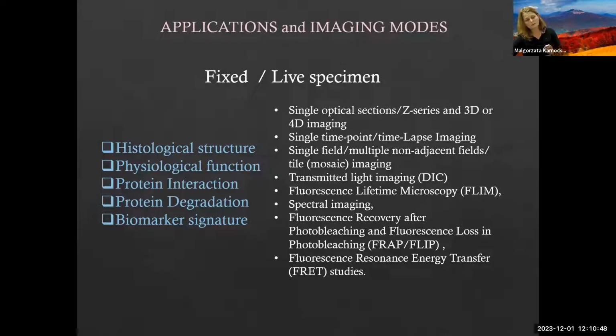What I wanted to focus on today a little more is some imaging techniques which allow us to evaluate protein interaction and protein degradation. And finally, I will talk a little bit about biomarker signature setting imaging, which we can do with the multiplex Phenocycler system.